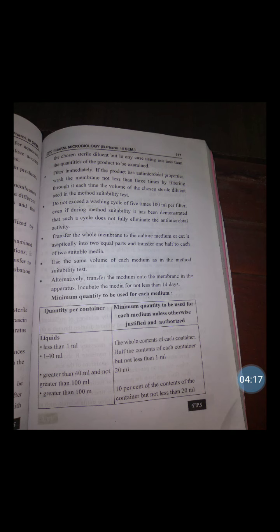Then transfer the contents of the container or containers to be tested to the membrane or membranes. If necessary, dilute to the volume used in the method suitability test with the chosen sterile diluent, but in any case use not less than the quantities of the product to be examined. Filter immediately if the product has antimicrobial properties.